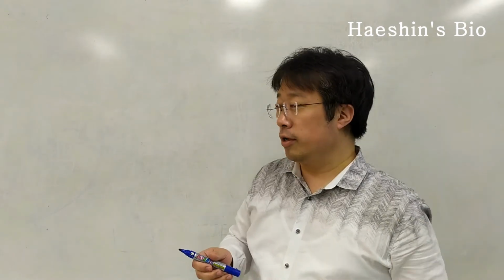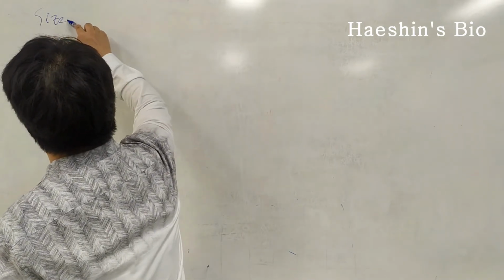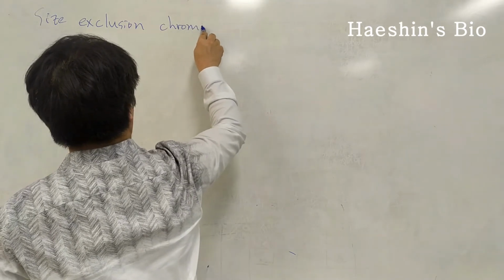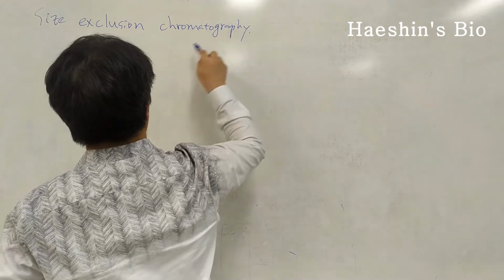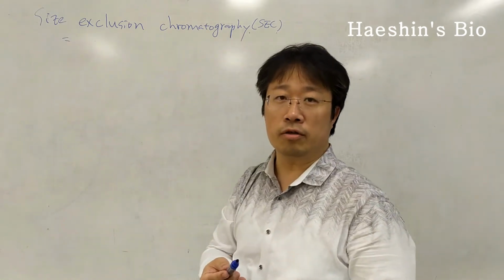Before going this way, I want to introduce the principles of size exclusion chromatography.